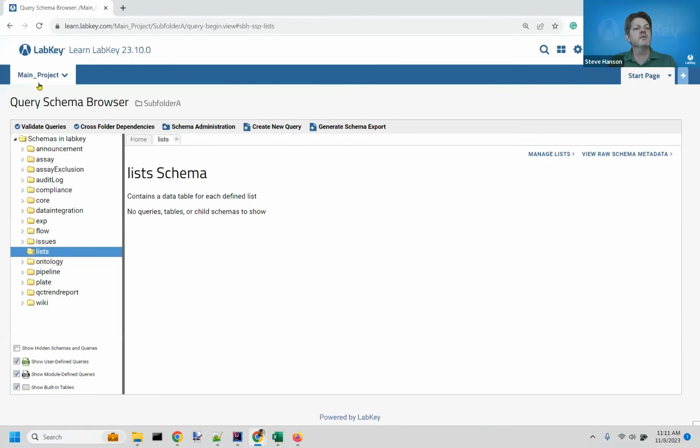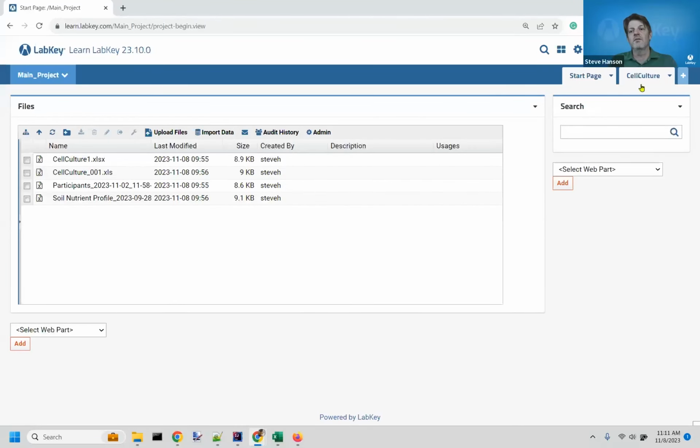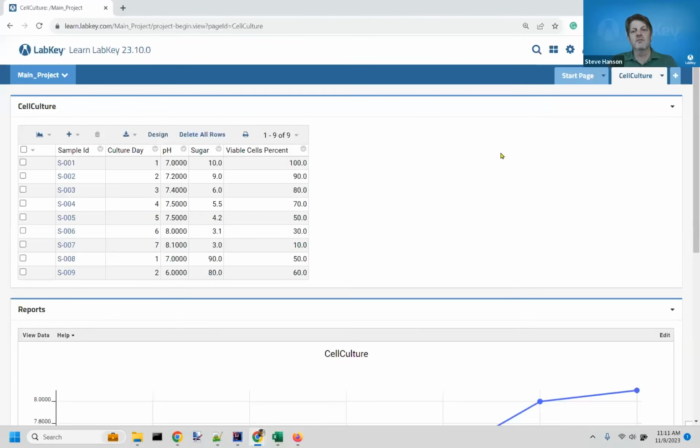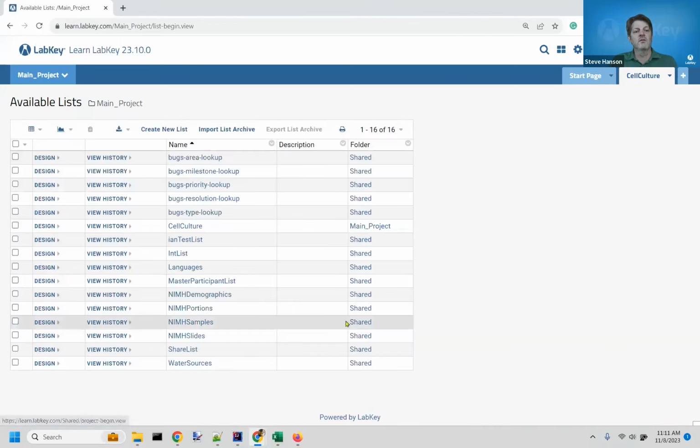Go back up to main project here. There's a list. Let's go to the design. It looks fine to me. Oh, is this why? Here, let's try this.